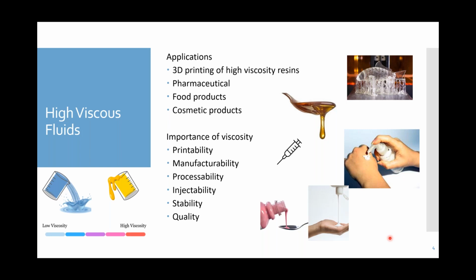In food products, viscosity is also a characteristic of the texture of the food. This means that the viscosity of a product must be controlled and measured in production so that each batch is consistent from day to day. Viscosity measurements can also be used to evaluate the stability of a product. That includes storage stability or aging stability, shear, and temperature stability. Generally speaking, viscosity of a product is an important parameter as it can be used as an indicator of quality of the product, and it is an essential component of quality control.